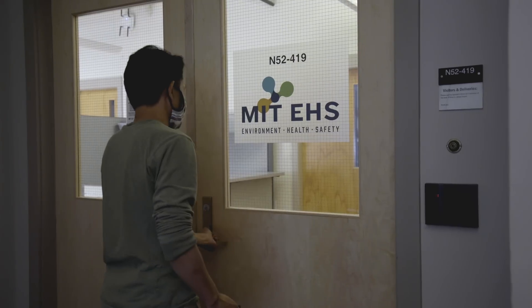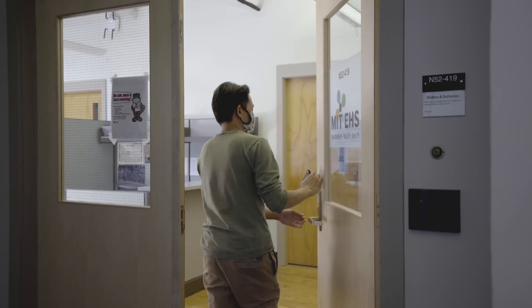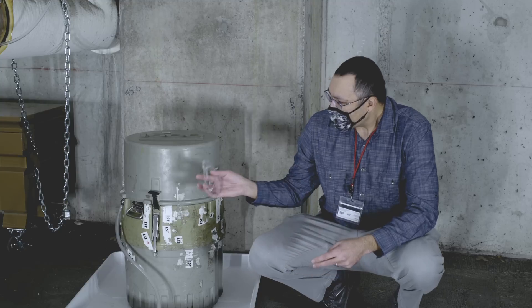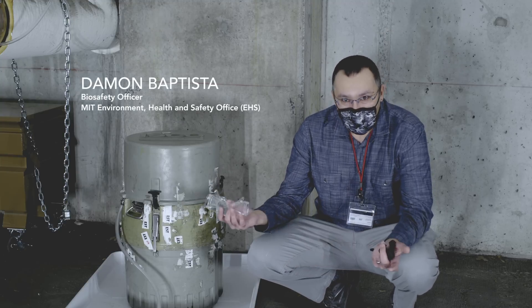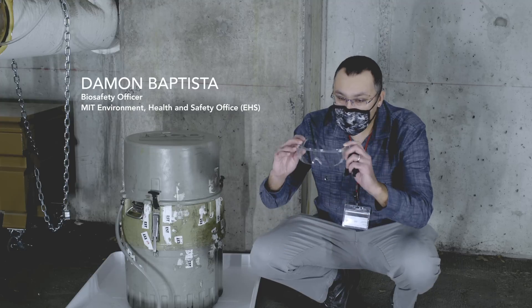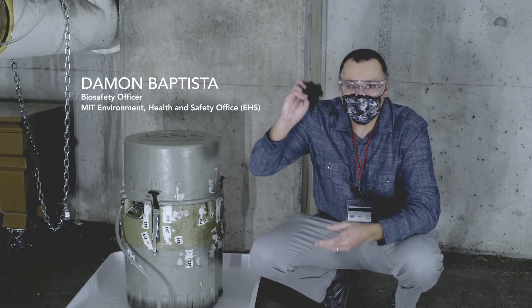MIT's Environmental Health and Safety Office is an integrated office of safety professionals from a wide variety of disciplines. We look at certain things for this project. One of the things is what kind of personal protective equipment people will wear. Some examples are safety glasses and gloves.